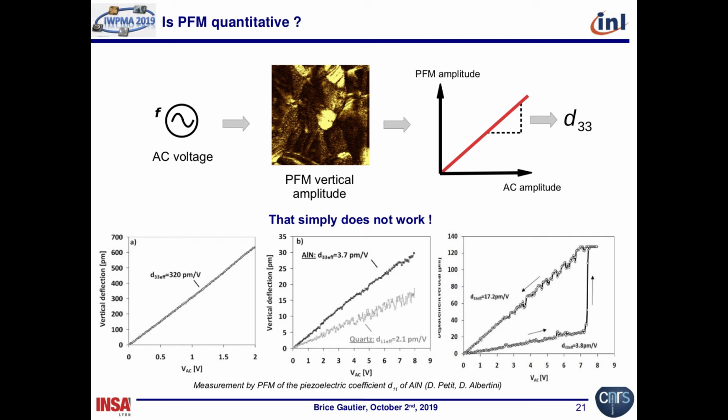If you change the experimental conditions of the PFM experiment, you will change the conditions of contact. And on Friday, I will show you the numerous sources of error that you can get from the AFM measurements. It's not quantitative. Of course, you can refer to a known sample.